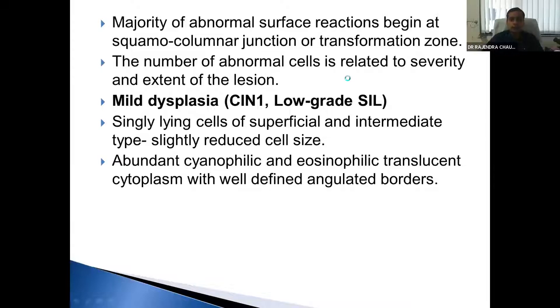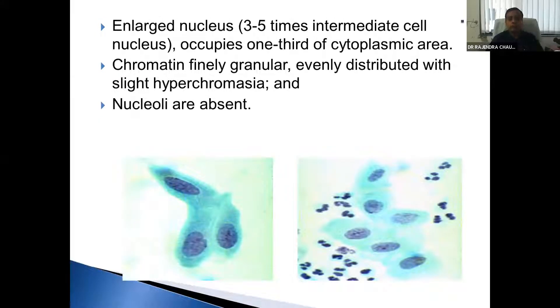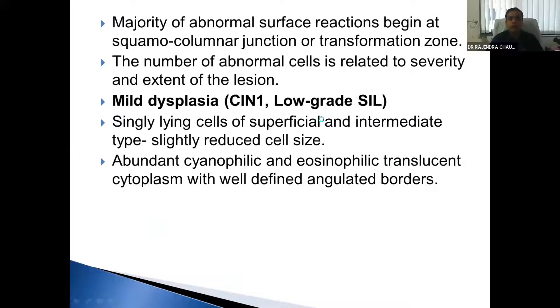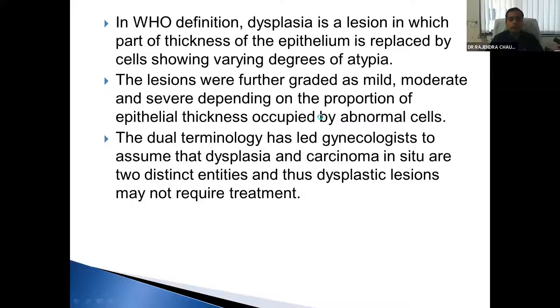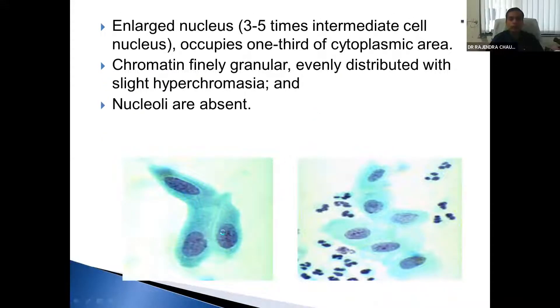Starting with mild dysplasia, also called low-grade SIL: the cells are singly lined and the majority are either superficial or intermediate cells. The cell size is slightly reduced compared to normal cells on the Pap smear. The cytoplasm is abundant, cyanophilic or eosinophilic. The nucleus is enlarged, around 3 to 5 times the nucleus of the intermediate cell. The chromatin is finely granular and evenly distributed with very slight hyperchromasia. Nucleoli are absent.